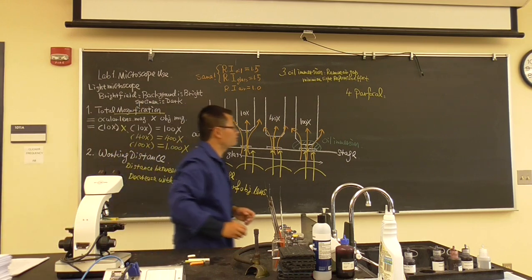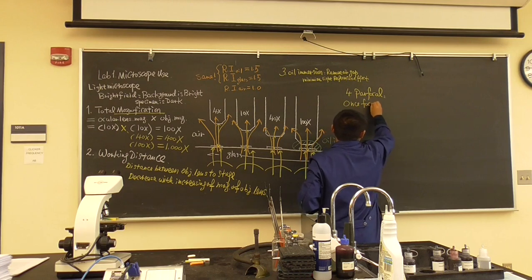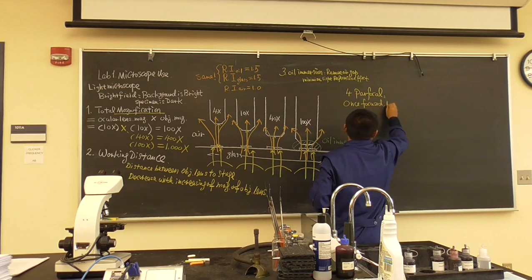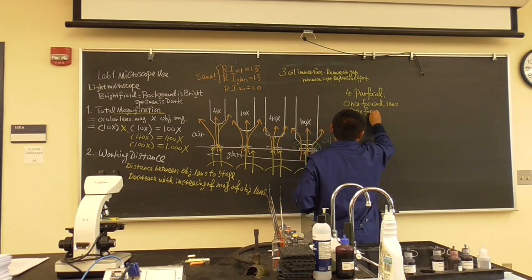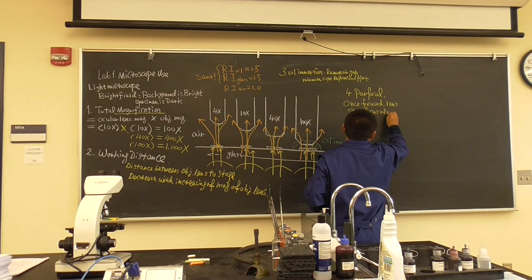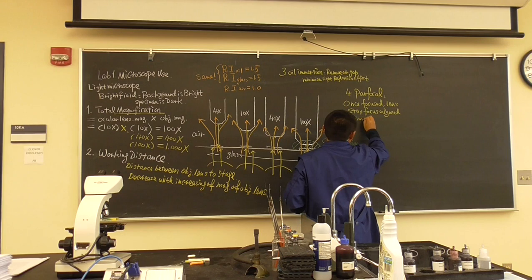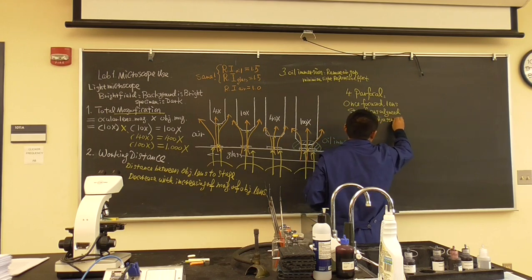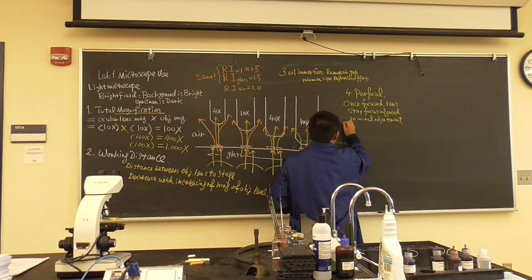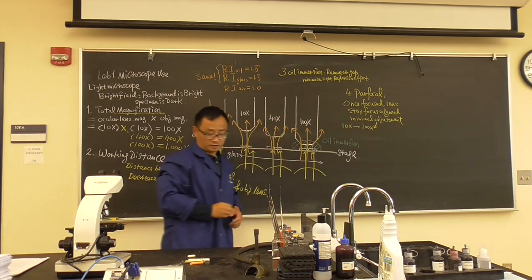So, what does parfocal mean? Once focused, the lens stays focused. Only a minimal adjustment is needed. So that means when switching from 10x to 100x, you only need a very tiny, minimal adjustment.